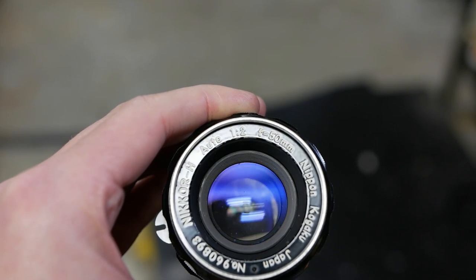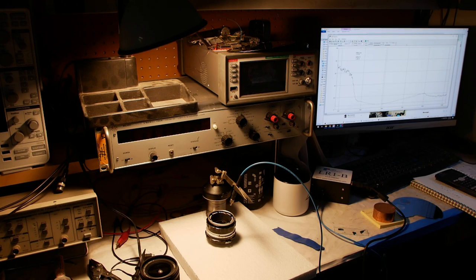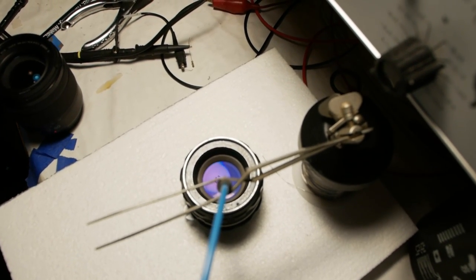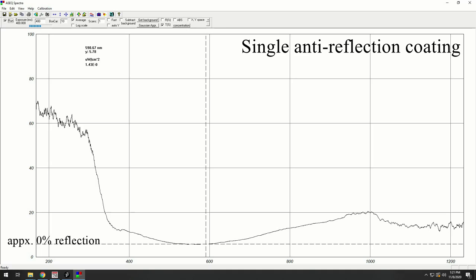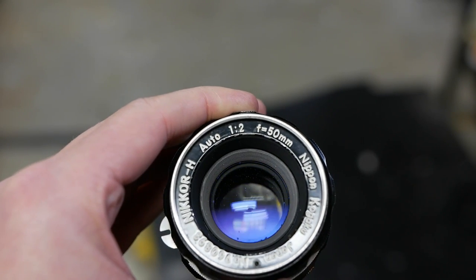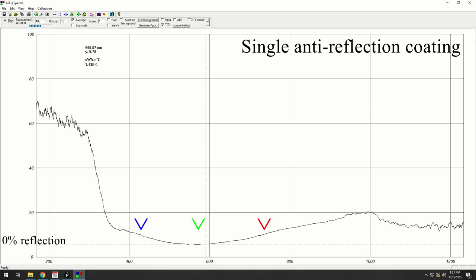So let's check this out. We'll take our single-coated lens over to the spectrometer. And I'm using a tungsten light source because it's broadband and easy to use. And we will aim the spectrometer at the coating so we can get a sense of it. And yeah, sure enough, it cancels out very well. The spectral response shows that right at green, right at about 550 nanometers, we're getting much less reflection than we are elsewhere in the spectrum. So we essentially have like a one-frequency filter. This is why single-coated lenses have a purplish cast to them. The green has been removed, but there's actually more red and blue light in the reflection, which gives them that purple color.